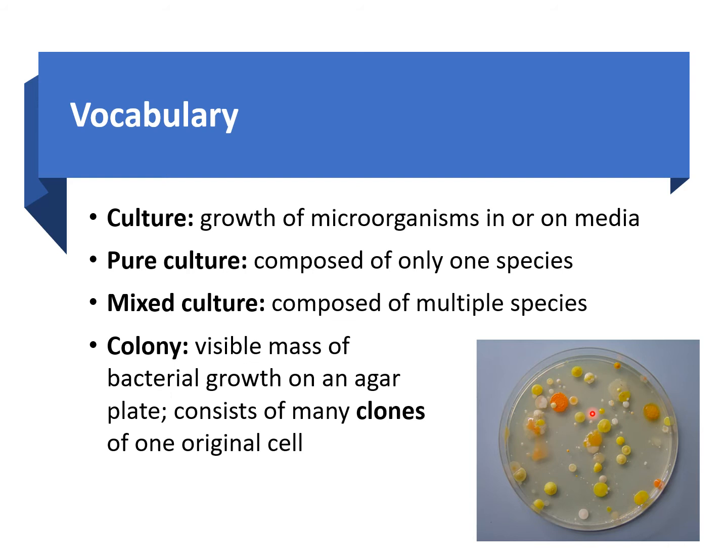The difference in color, the difference in size of the colonies, their margins, their textures, and then as I said, some colonies are elevated, some of them are pretty flat. See how this one looks elevated, this one looks flatter. So all of these differences tell me that I'm looking at a mixed culture plate, meaning that I have multiple species of bacteria cultured on that one plate.